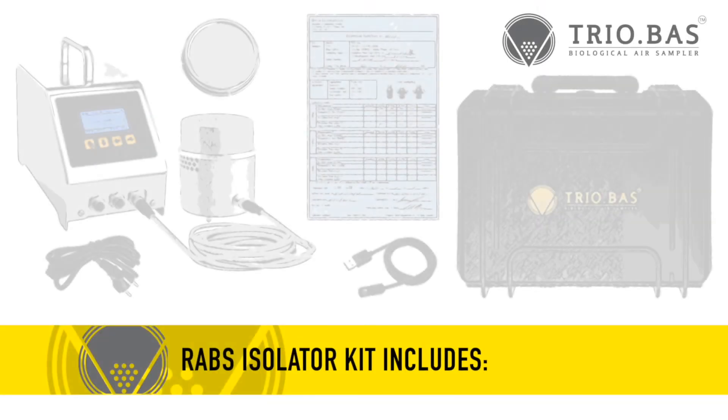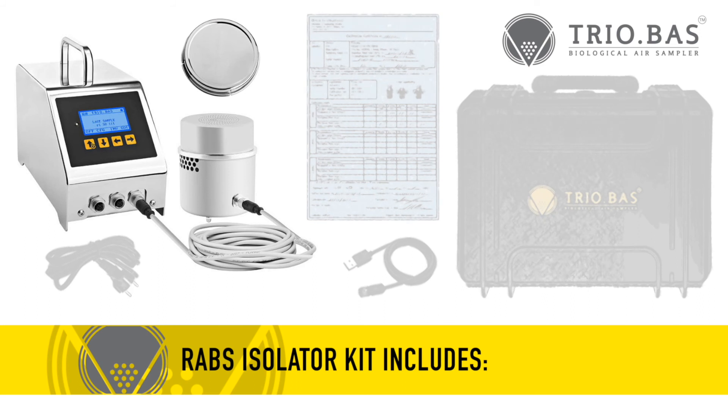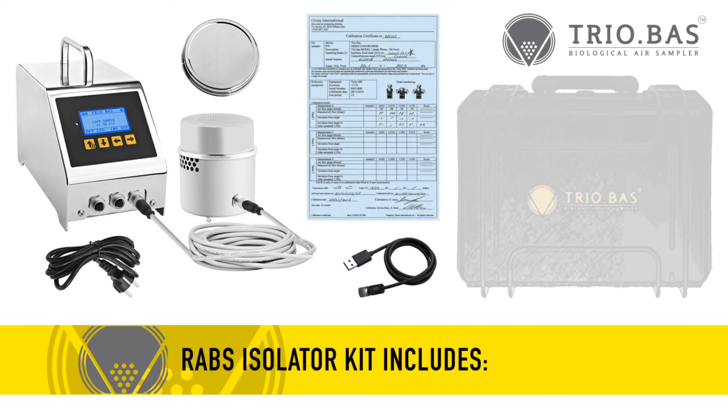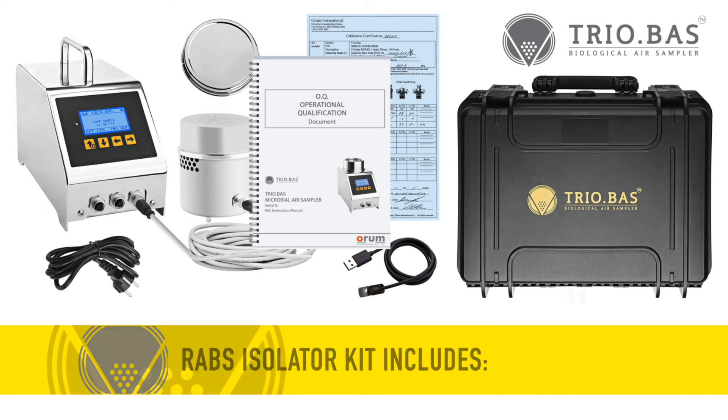The RABS isolator kit includes the instrument, one aspirating chamber satellite with one 5-meter-long attachment cable, one stainless steel aspirating head cover, one instrument charging cable, a cable for optional sampling data transfer, the manufacturer's calibration certificate, IQ-OQ-PQ documents, and a carrying case.